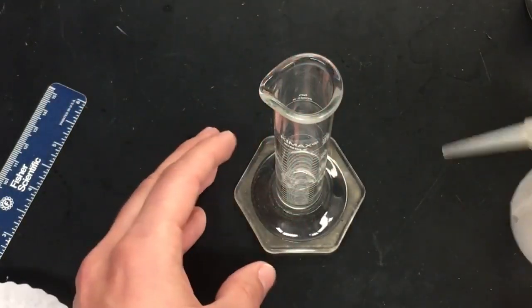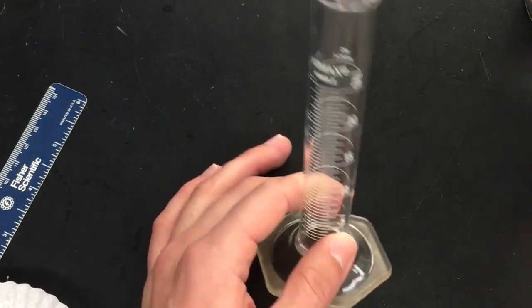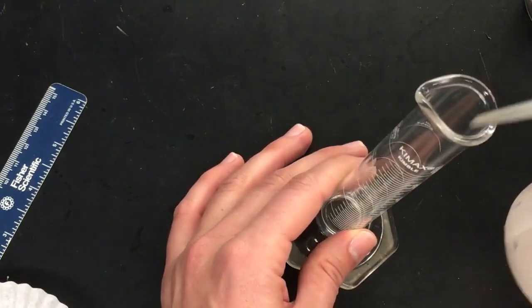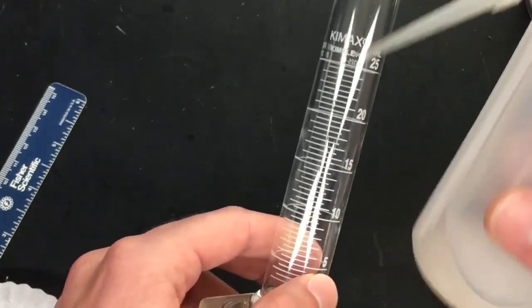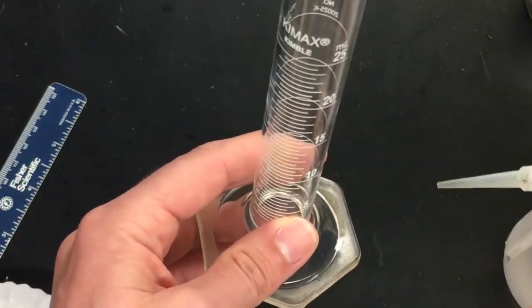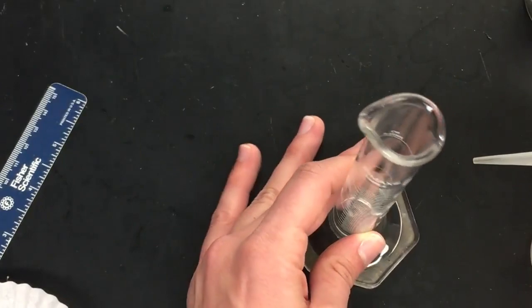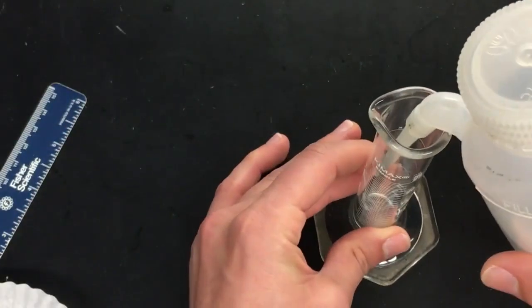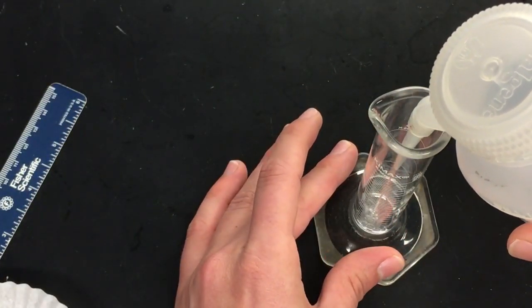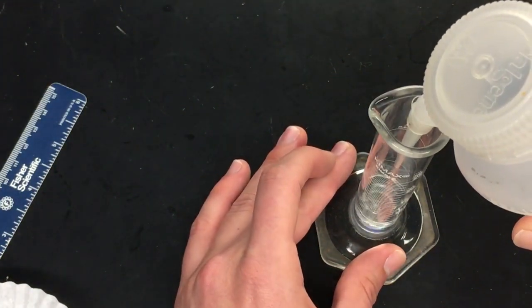So, to get to the actual experiment, I'm going to take our graduated cylinder. It was recommended we fill it up to about 10 milliliters. You want it to be deep enough so that this thing can be completely submerged. The other thing is you don't want too much of the water to stick to the sides when you're squirting it, because later in the experiment it can finally fall down, and it can affect our measurement. So I am going to try to put the neck of this a little deep in there. I'm going to squirt straight down until I can fill it up. Pretty simple, nothing too groundbreaking here.